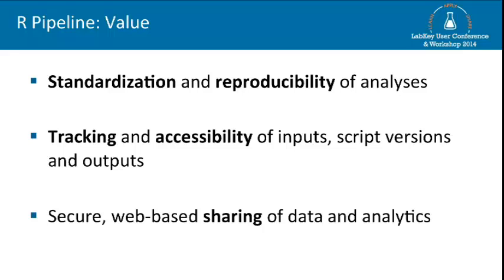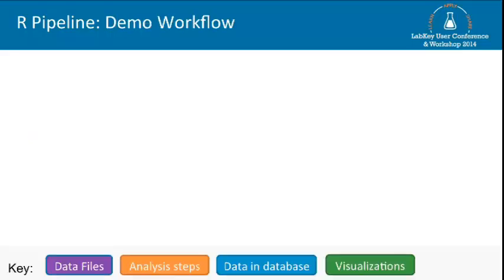What we would like to do is give them the access to do that while using the built-in functionality in LabKey, so they can still share the data, publish the data, standardize it, and give access to multiple users. I also have to say that the feature is being developed by Kevin, who's standing right here with me, in collaboration with, and funded by, Raphael's group.